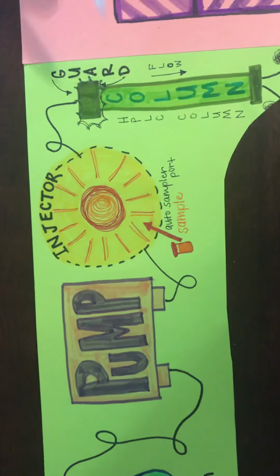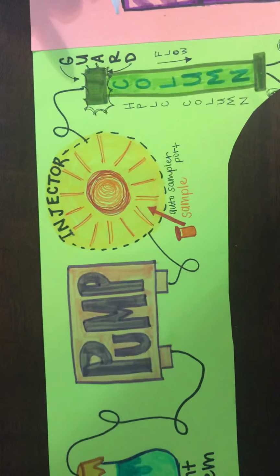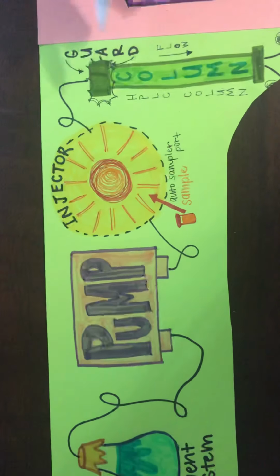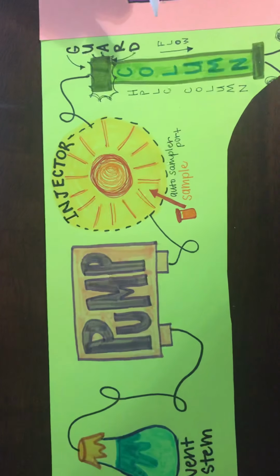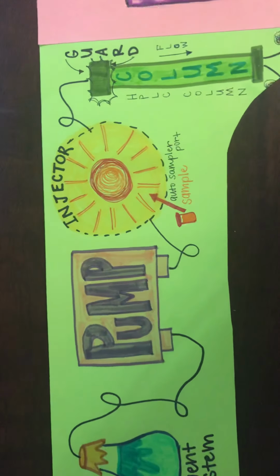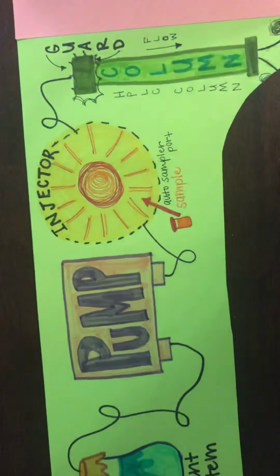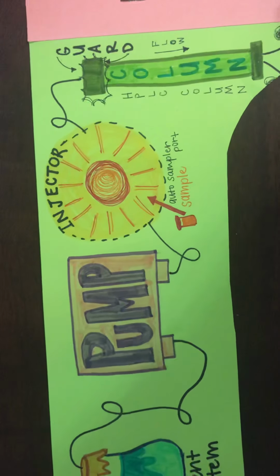For HPLC, the most common stationary phase used is the packed column. And this has the advantage that when our analyte is traveling through this material, it promotes interaction with the stationary phase. And so imagine that you're trying to pump your sample through a tube with only a coating on the wall. Interaction between our analyte and the stationary phase would be very minimal and limited, and not homogeneous, which is what we want, which would give us a bad reading and would probably result in band broadening, which we are trying to avoid.